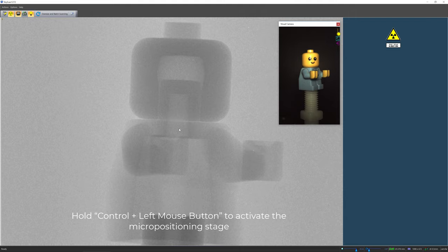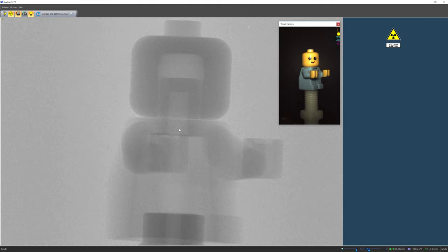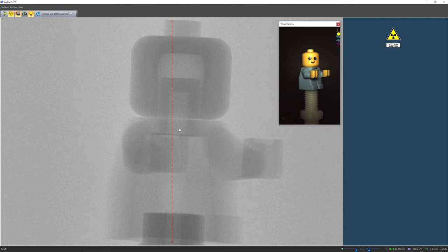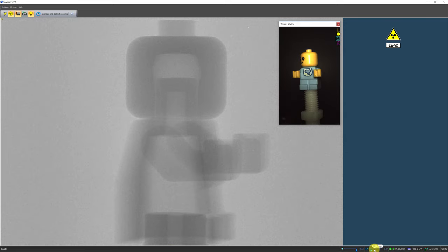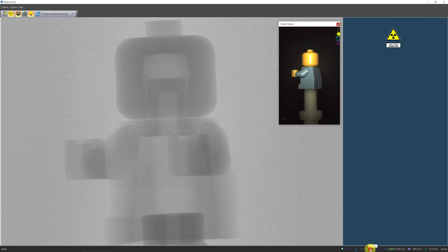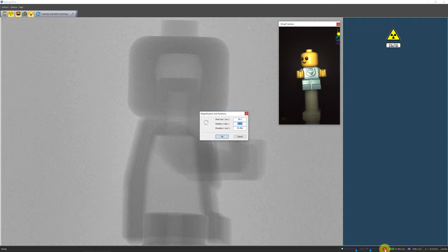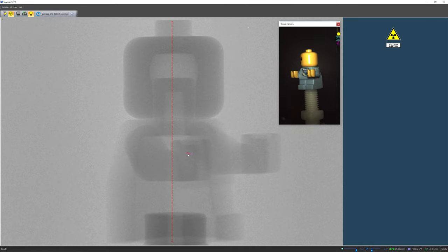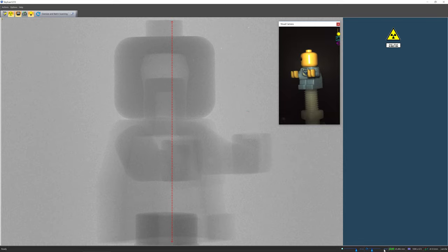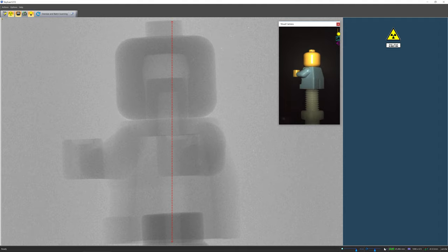Next we will use the micro positioning stage to align the rotation axis of the sample to the center of the x-ray detector. On the screen there are two yellow tick marks — one at the top and one at the bottom of the center of the screen — to help you align your sample to the center of the detector. To change the rotation angle of the object, either click on the scale at the desired degree in the status bar or call out the magnification and position dialog by clicking on the rotation column number. We can activate the micro positioning stage and center the sample at 0, 90, 180, and 270 degrees to align the sample's rotation axis to the center of the detector.